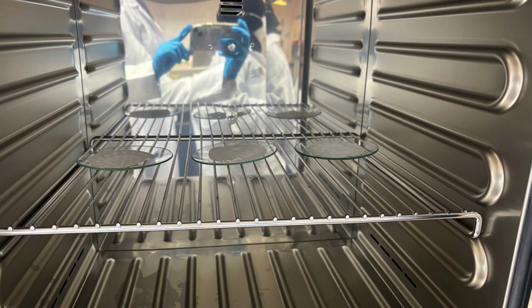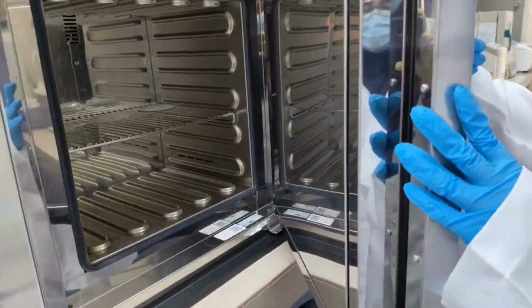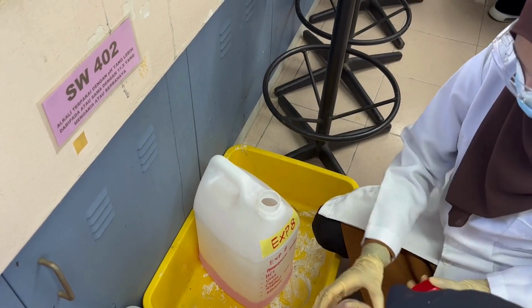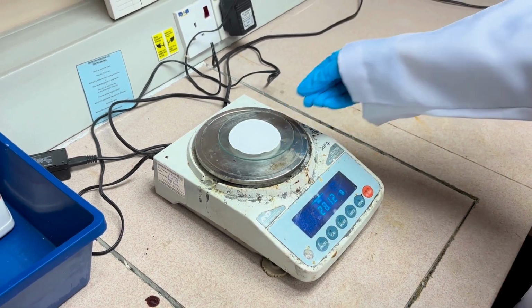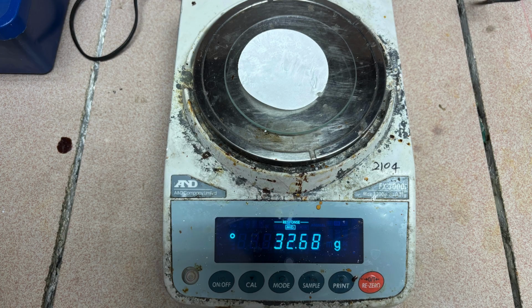After putting the filter paper on the petri dish, place the petri dish into the oven for 1 hour at a temperature of 105 degrees Celsius. Make sure to properly dispose of chemical waste into the bottle prepared by the lab assistant. After drying for 1 hour, record the mass for each precipitate formed.